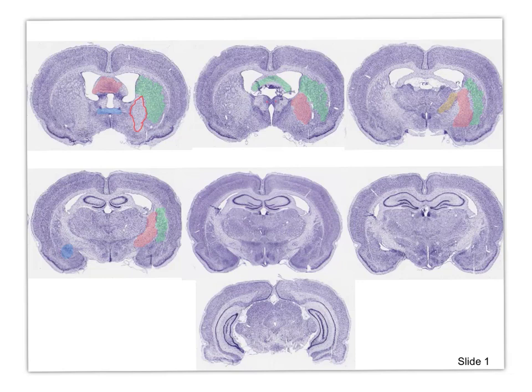So here's caudate on the next one. And if we look really carefully here, we can see these little cell bodies right smack in the middle of the posterior limb of the internal capsule. That, in a rat, is called the entopeduncular nucleus. And that is the GPI.